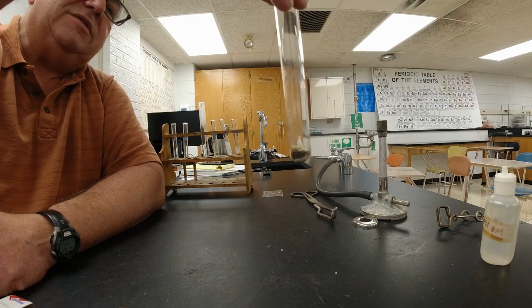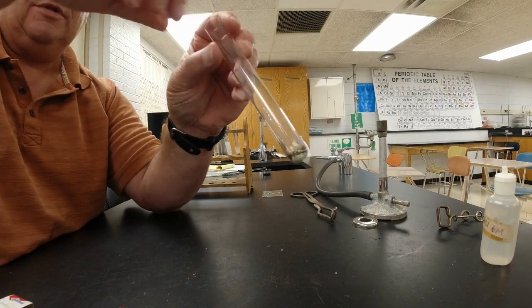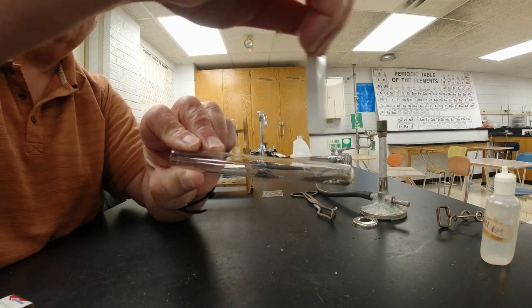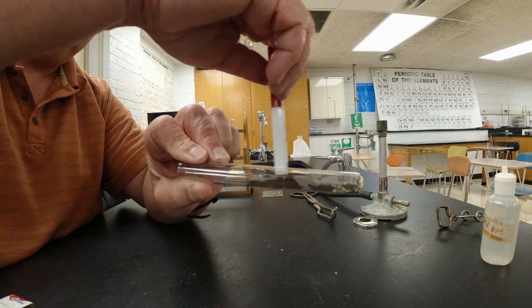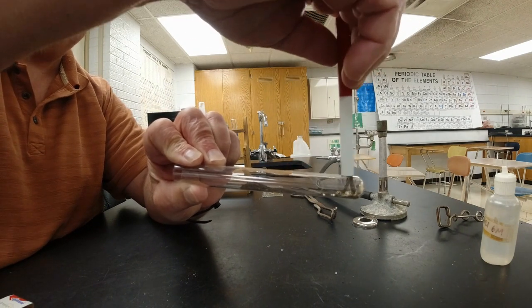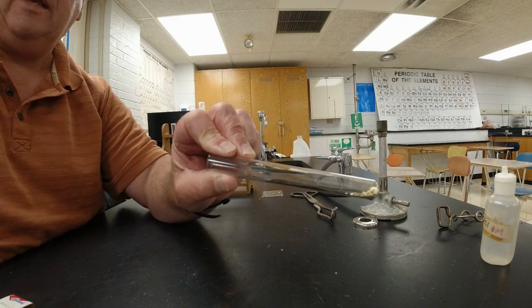So is there any possible way to separate these two powders now? I hope some of you thought about using the magnet. We could use the magnet and drag all of the iron, or at least most of the iron, away from the sulfur, and leave the sulfur at the bottom. That would be using a physical property to separate two chemicals that are physically mixed together.